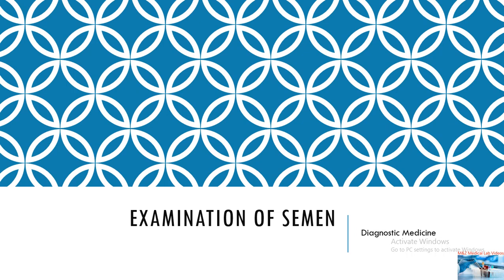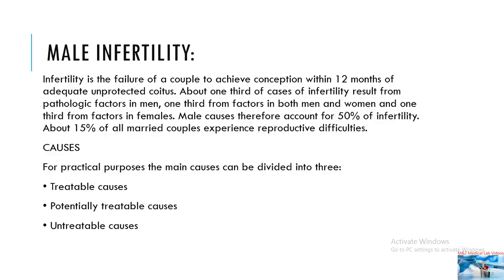Bismillahir rahmanir rahim. Today the topic of our presentation is the examination of semen. It is also called semen analysis. It is done in case of male infertility and other diagnostic tests if required.